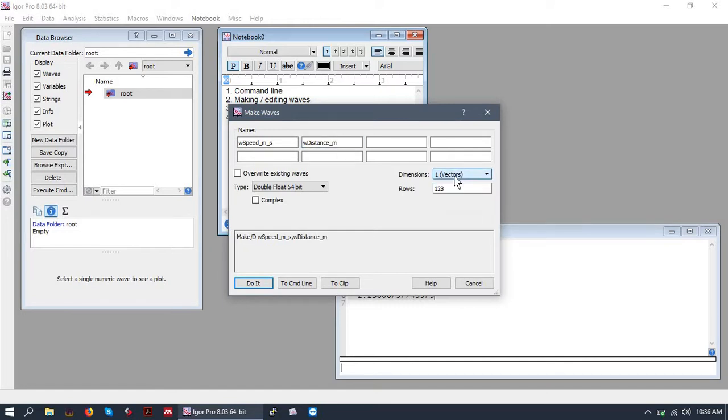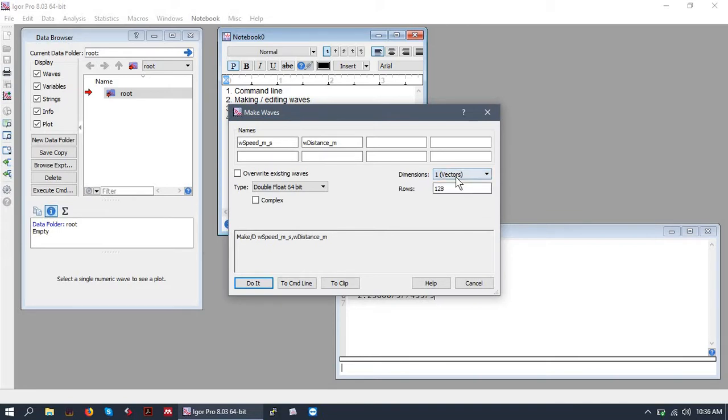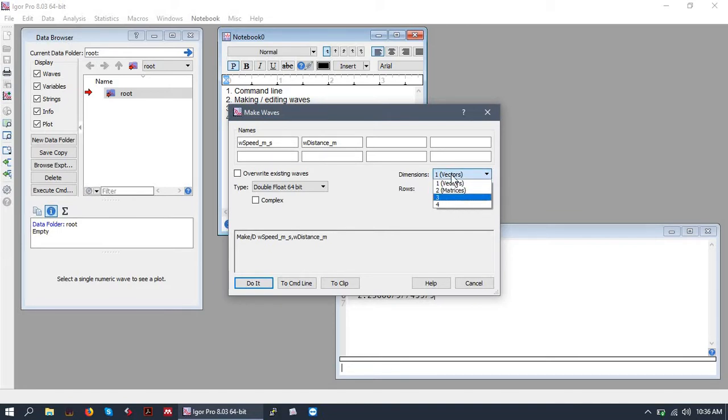And we'll make a wave named distance in meters. Let's keep these at one dimension. Like I said before, you can go up to four dimensions. I have never had to go above two, but I suppose if you're doing some crazy stuff, you might need four. I'll make these eight rows.